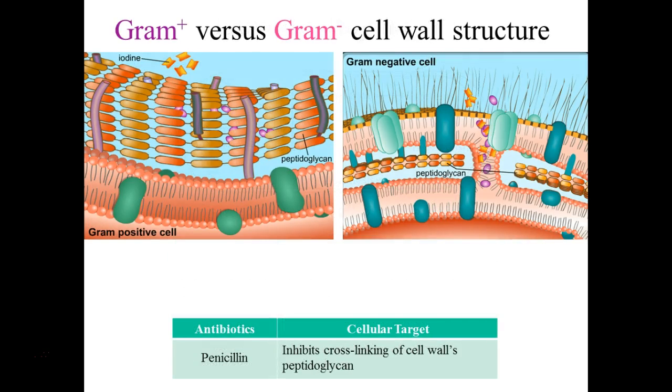So that's another reason why for our lab we did 2 different organisms. We did gram-positive and a gram-negative, right? Because structurally, especially as it applies to the cell wall, they're distinctly different, right? So remember, our gram-positives have that very thick layer, peptidoglycan, and the gram-negatives have a very thin layer. So they're affected differently. So if you guys notice on your plates, E. coli, did penicillin affect it? No. If you look on your plates, right, it grew all the way up to the penicillin disc. Penicillin didn't affect it at all, right?